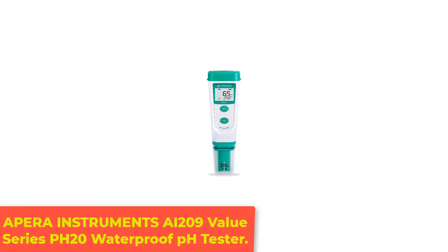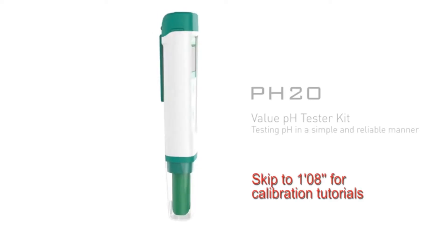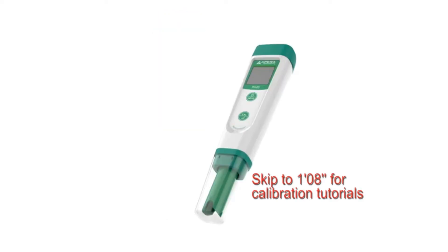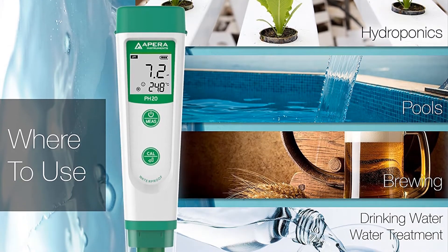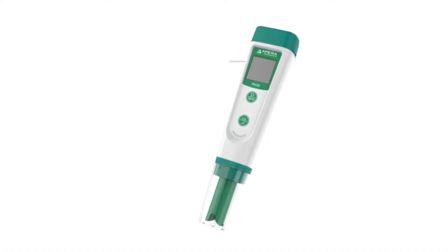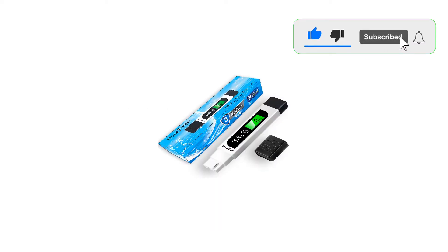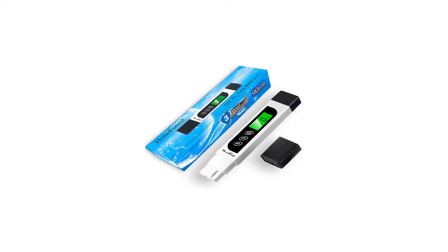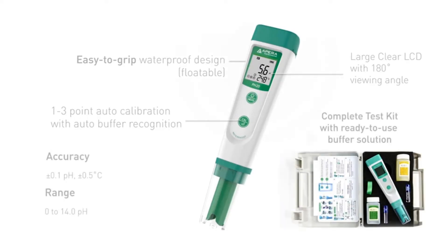Number 3: Apera Instruments AI209 Value Series pH 20 Waterproof pH Tester. The Apera Instruments AI209 pH meter is a portable pocket tester that is easy to carry and use anywhere. This pH meter is affordable, compact, and includes automatic temperature compensation. The low-impedance sensor gives a quick response rate and accurate reading. The device comes with a lanyard as well as a carrying case with pH 4 and pH 7 buffers. Some users noted that the calibration can be difficult and time consuming, and others found the instructions challenging, recommending online videos instead of the included instruction manual.